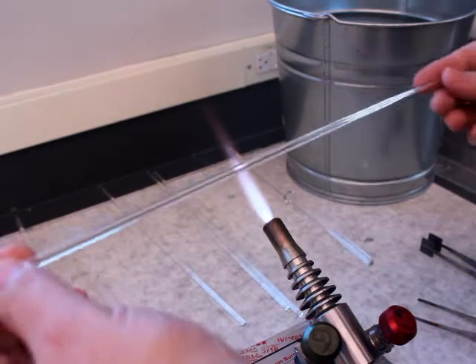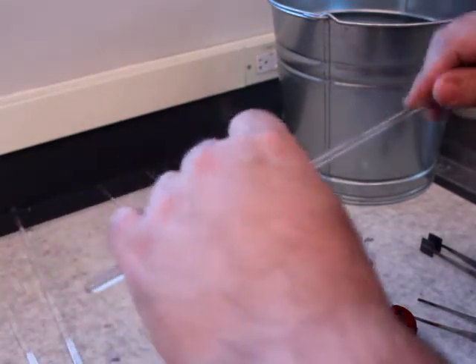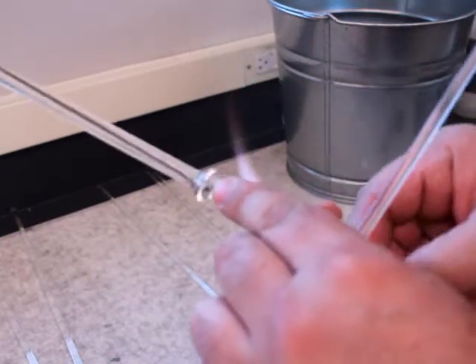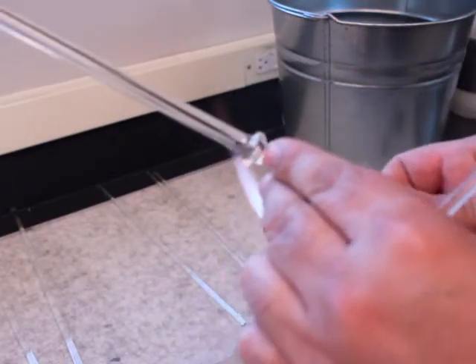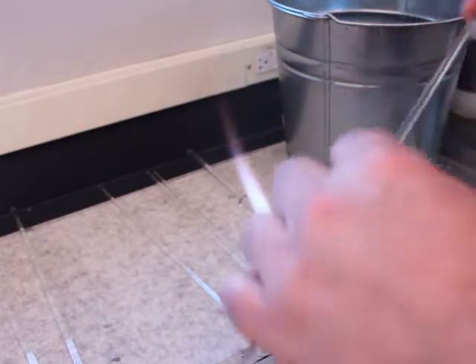What I'm going to do now is make a series of Maria's. Here's a big version of a Maria, which are indentations in the glass where you push the glass together. You can also make them on the ends as well, using a slightly different technique.